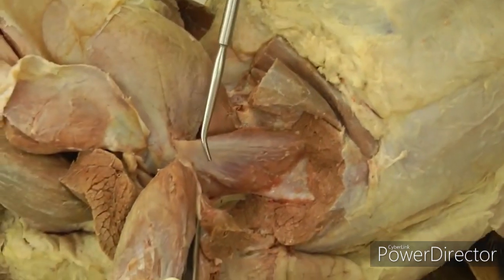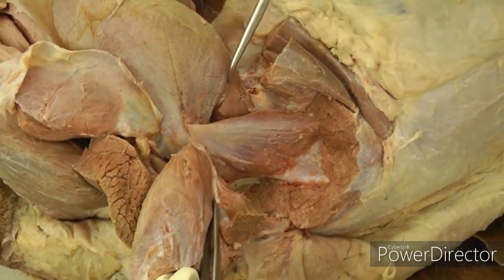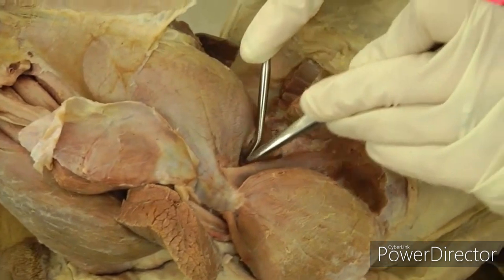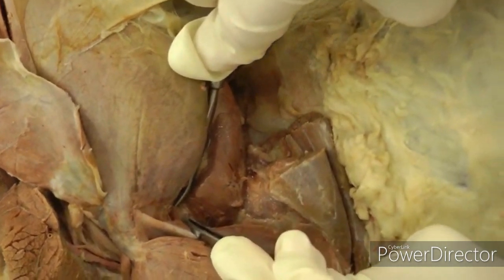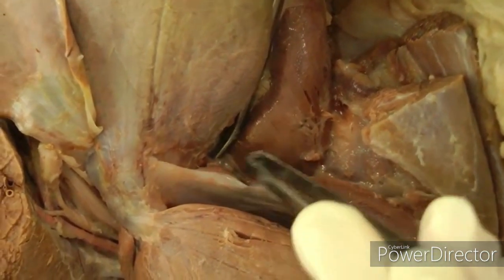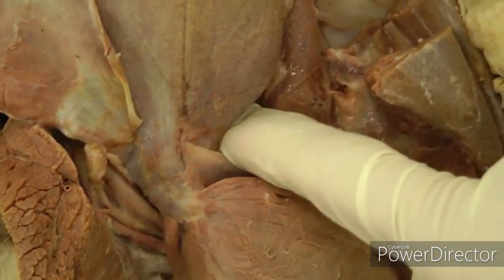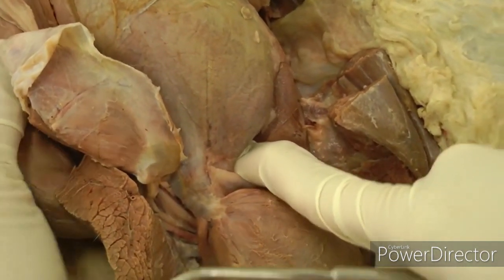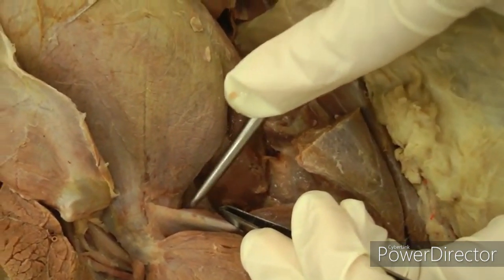The deep gluteal has a fan shape right here — we are not transecting that one, just leave it intact. There is also a tiny muscle called the articularis coxae, located right under the cranial edge of the deep gluteal. It's small but important to find because if you put your finger on it and move the limb, you'll feel that it's a marker for the hip joint — you can feel the movement right underneath it.